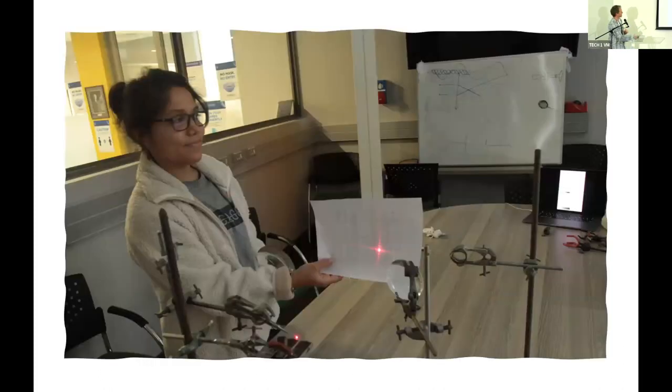Okay. So this is just an example, very briefly, of teaching some kind of optics. I have a whole series of lenses. We just shove them together and the students then build a microscope. You can see a lens over there, some clamps. If you need an aperture, you puncture a hole through a piece of paper. Then you hold that up. There's your aperture. What effect does it have on your image? This, I think, is the way of learning it. And while learning about the Fourier transform, you actually put a smile on somebody's face, which if you're doing it on a piece of paper, you certainly don't get. Okay.